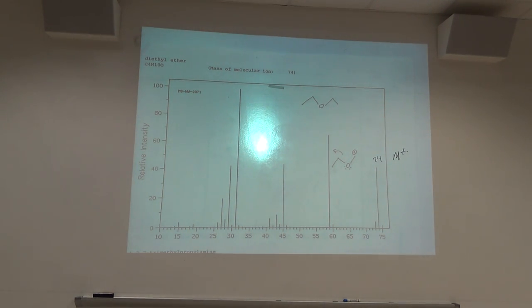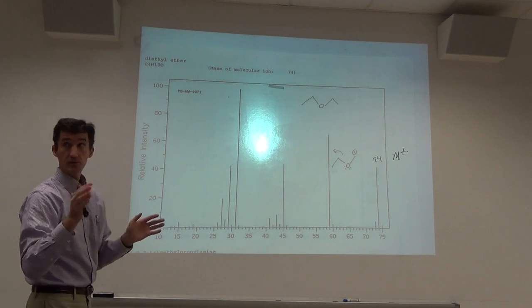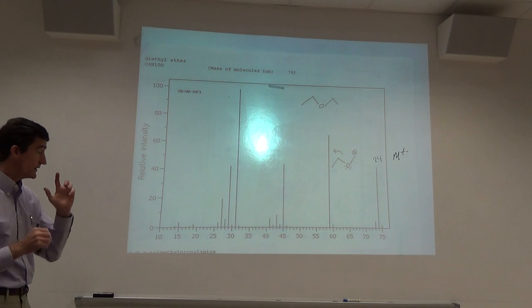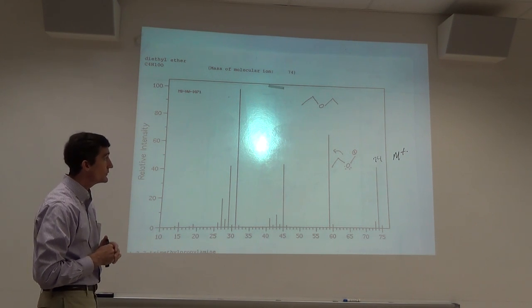Then it was pulled through the magnet, deflected at a degree that equaled, after calibration, 74. Because you can turn the degree of deflection into molecular weight, because the deflection is based on the molecular weight. It's a physics law. It involves calibration. It's turned into a simple idea.